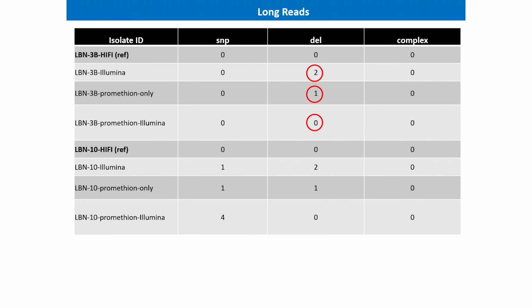So you say it's really good, but the assembler and the extra polishing does not always work. So you had one SNP with this sample and one SNP with this sample, and then when you combine, you have 4 SNPs. And this is because of the extra polishing. Normally, this is what goes wrong. But again, deletions are also always solved.